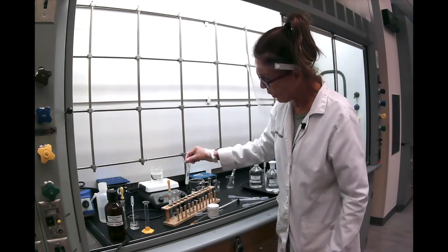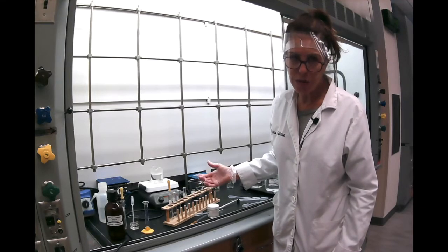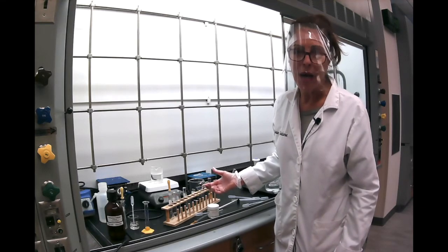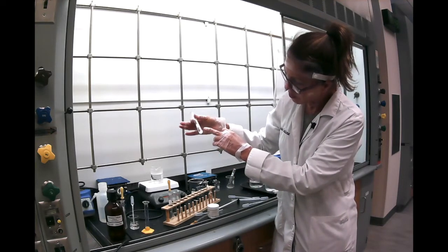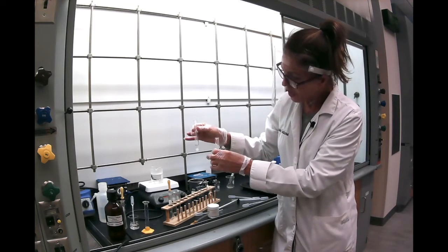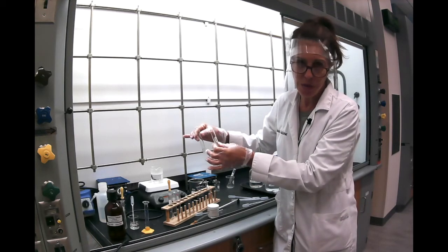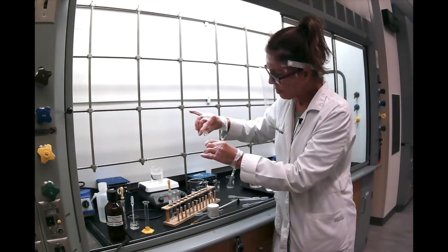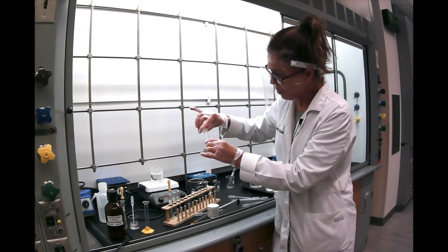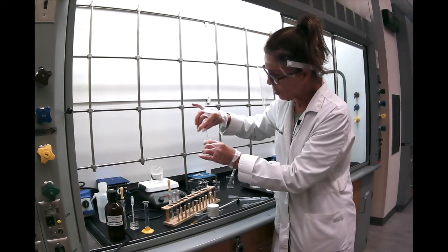to do its work. And then we'll transfer it into a clean, dry test tube. So at this point, as you can see, the liquid is quite clear. We can either decant it here, or you can pipette it out. I prefer to decant it, but if you're not very comfortable with that, just use a clean glass pipette and pipette it out slowly.